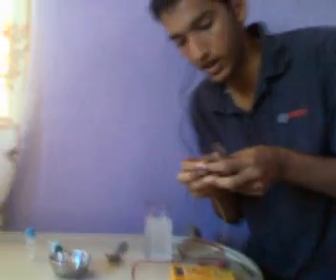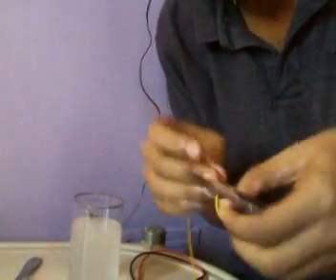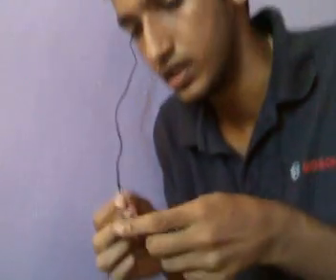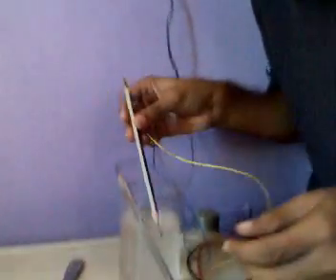Now you have to connect one end of the pencil to the adapter's output, and insert this pencil in the salt solution. Insert both pencils in the salt solution like this.